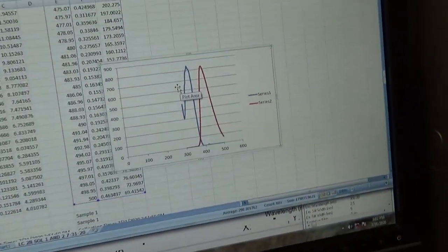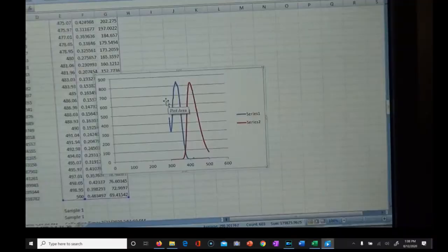Okay, so when you go to write up your own lab for this, I'll give you an Excel spreadsheet with the wavelengths and the excitation and emission spectra data, and you'll choose an appropriate scale for the 2 sets of spectra. You'll have 1 page for the solution 1 and 1 page for solution 2. You'll label the axes and put a title, and then you can actually find the crossing point using Excel by running your cursor on that crossing point, and it will give you the coordinates of that point.